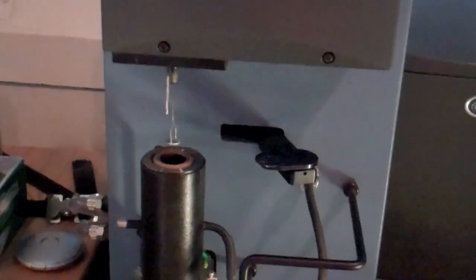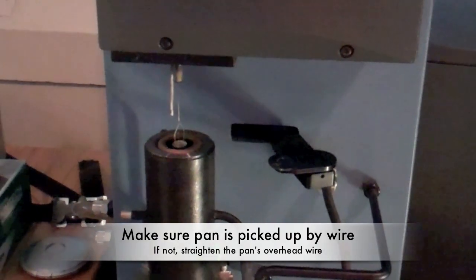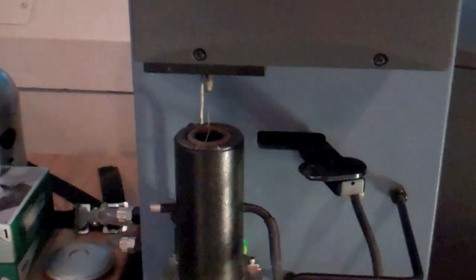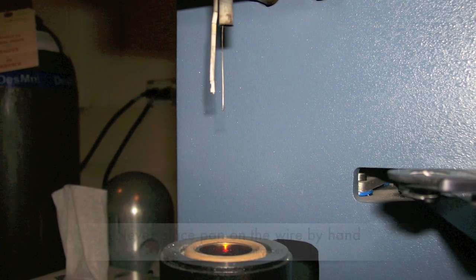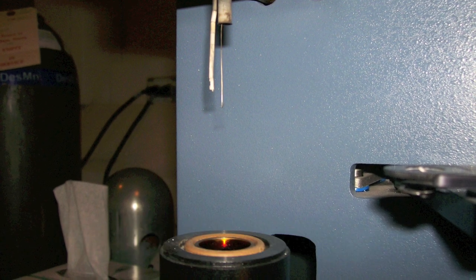Watch the pan enter the furnace for the first time. If the hang down wire does not connect with the overhead wire on the pan, it will not get picked up. If this occurs, straighten the overhead wire with the broad inside of a pair of tweezers or move the stage up and down with an Allen wrench. Never place the pan on the hang down wire yourself, as this will cause internal imbalances with your reference pan.